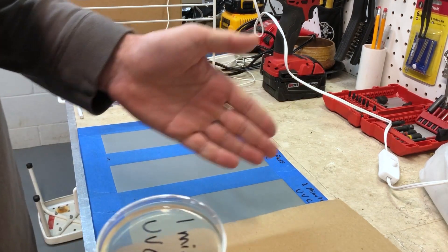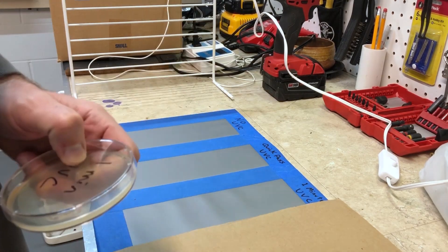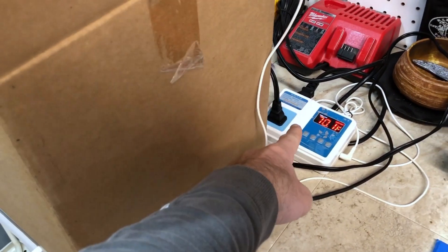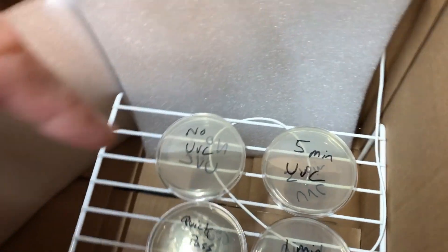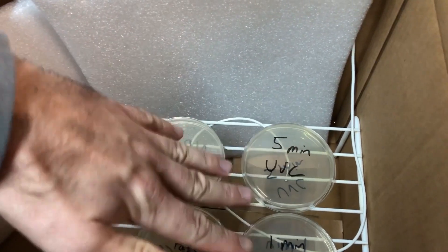Now that the one-minute exposure is done, I'm going to do the exact same thing on the other panel for five minutes. Then we'll put them in the incubator. This is my incubation box — an inline thermostat, a heat mat in a box, with the dishes sitting on a rack and a temperature probe on top of the rack to maintain temperature.